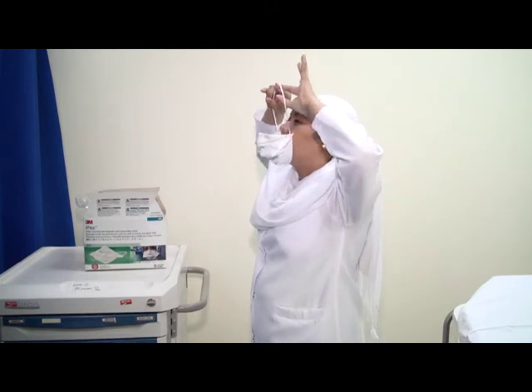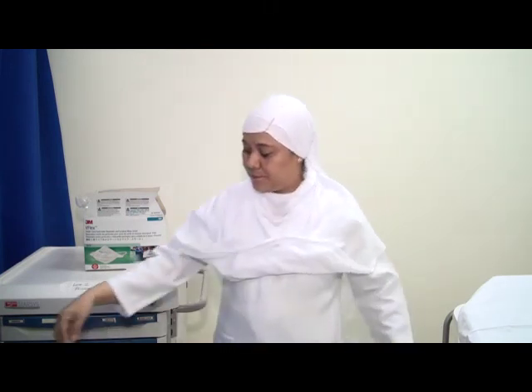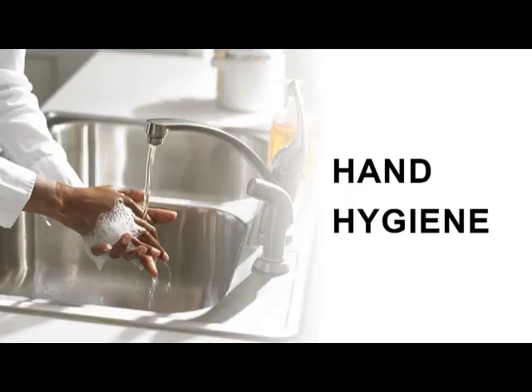Store or discard the respirator according to your infection control policy. Perform hand hygiene.